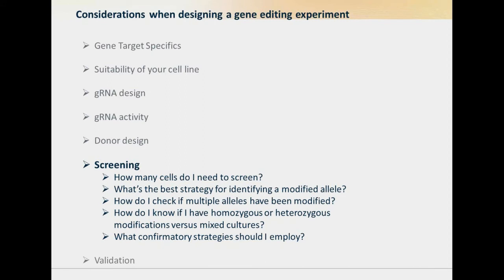You don't want to go through a whole bunch of single-cell dilution and growing these up for a couple of weeks to only find out then that probably nothing ever happened in your cell line. So it's nice to take some measure of the pool of your cells and be able to apply something like a PCR assay to see if at least the change that you're looking for exists somewhere in that pool. Then you've got to grow those cells up. You take a sample then, you screen that by PCR.